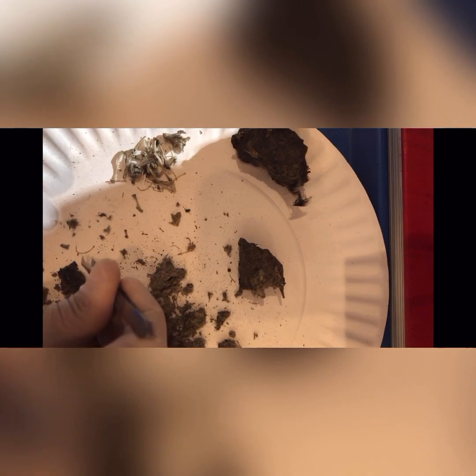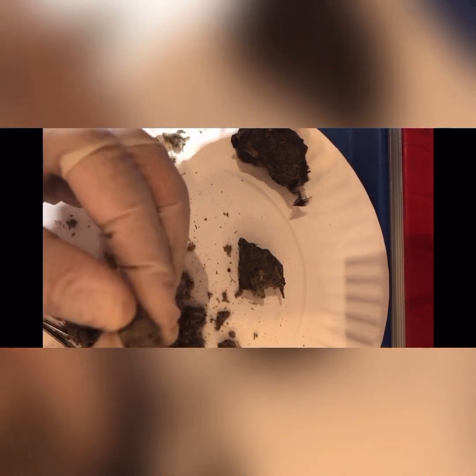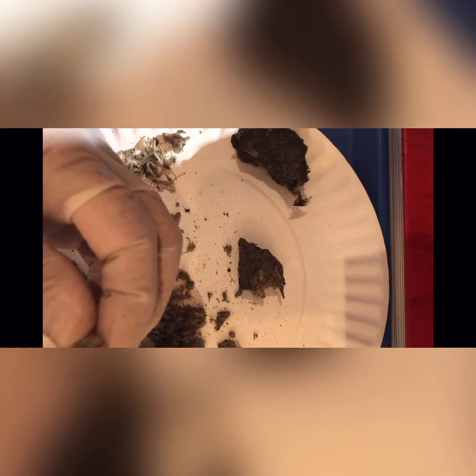And you guys know I'm collecting all these bones, and the reason we're collecting the bones is to reconstruct the skeleton of the animal that it last ate, right? And the reason I'm doing this is to be able to give me some more information about owls, what they like to eat, and owls in a particular region, if you see that they're eating certain things.